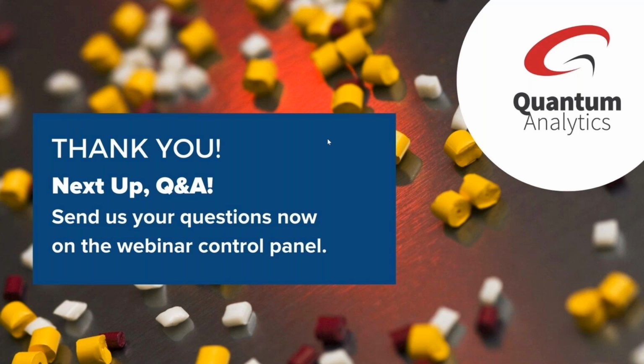That's a good question. Yeah, absolutely. Next question here is, can small differences in polymorphs be reliably differentiated?